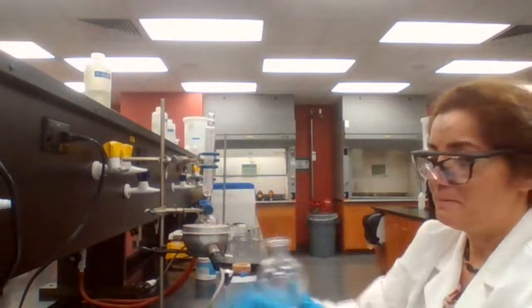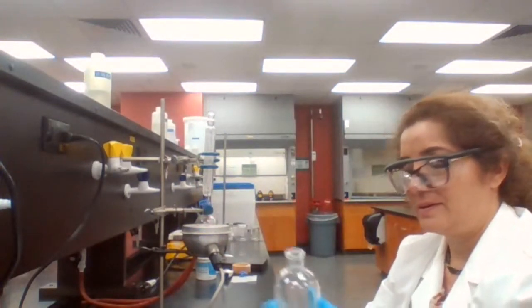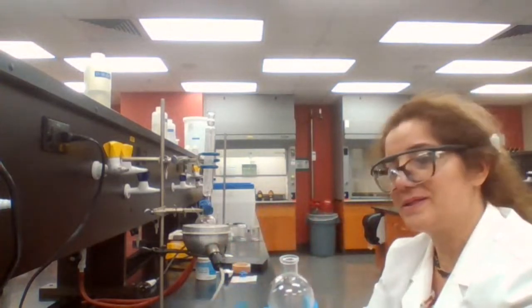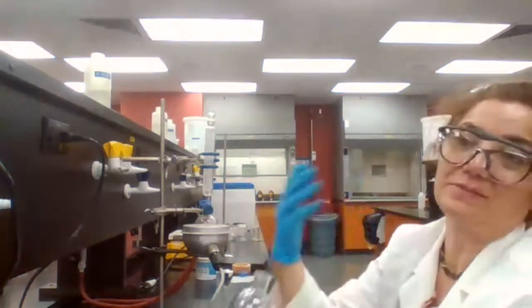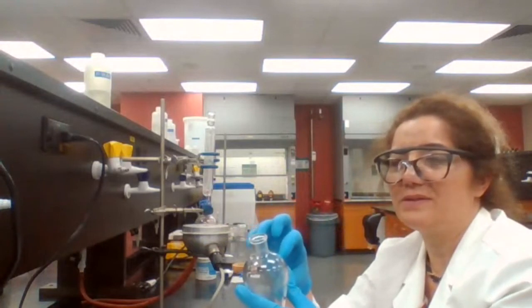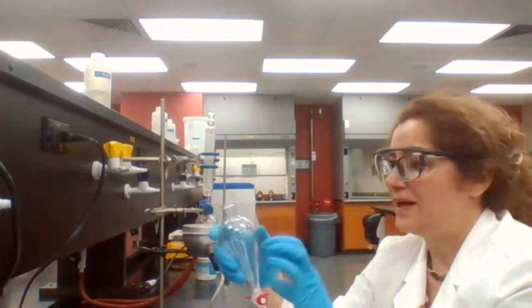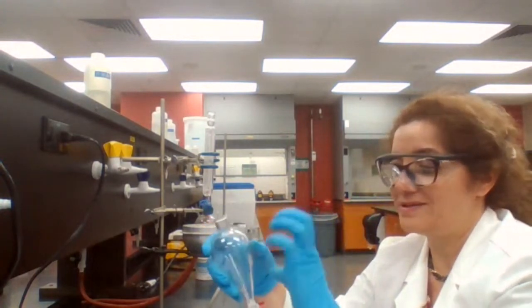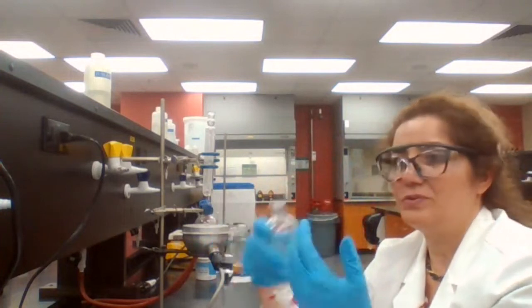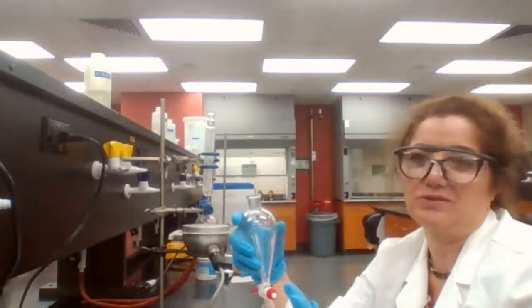If you don't drain it and you go to the next step, wash with sodium chloride, or wash with water, that is just going to react with the sodium bicarbonate. It's not going to wash the organic layer. Or sometimes you are doing consecutive extraction. If you add the first portion of the solvent, the first like 15 milliliters of the ether, and then you do not separate it, then you add the second 10 or 15 milliliters, and you separate once, that's just one extraction. It doesn't count as two or three extractions.